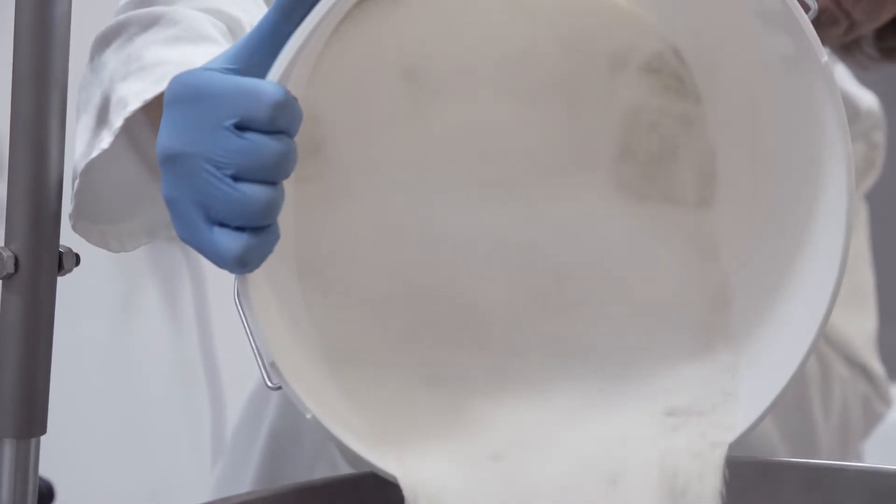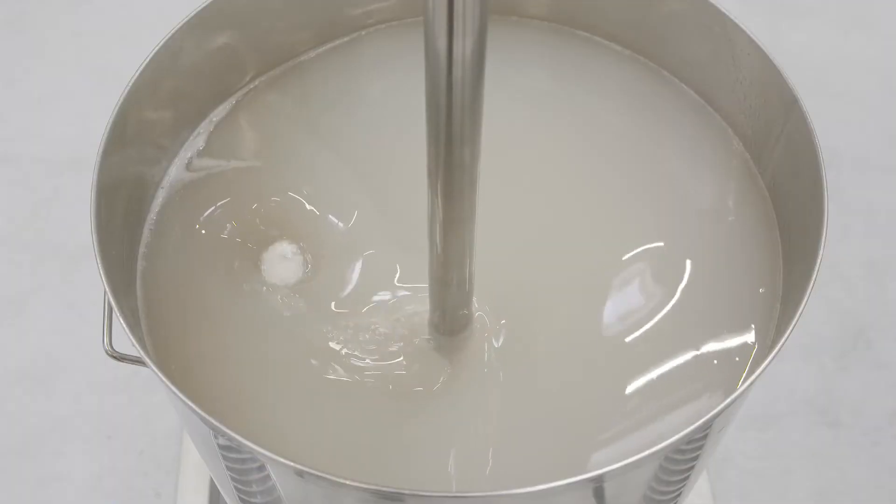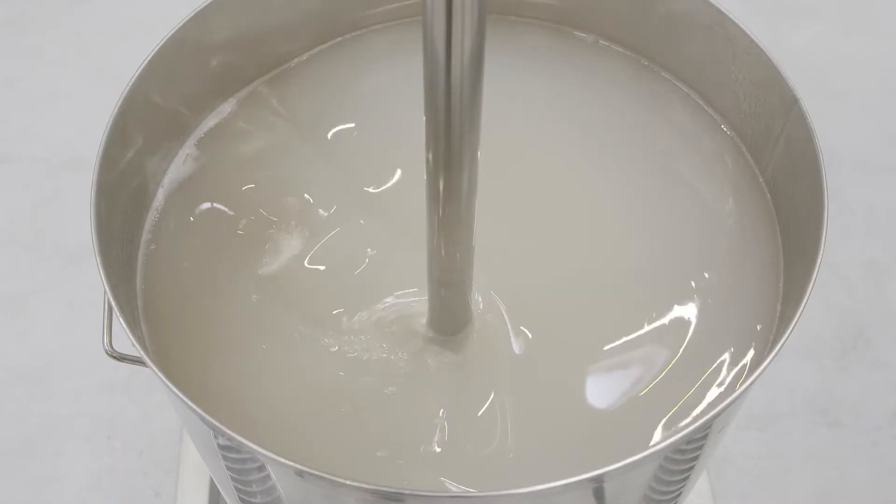A Silverson Ultramix is ideal for this application. The unique single-piece mixing head rapidly disperses the powder. The pectin is incorporated and fully hydrated in a fraction of the time taken by conventional mixers.